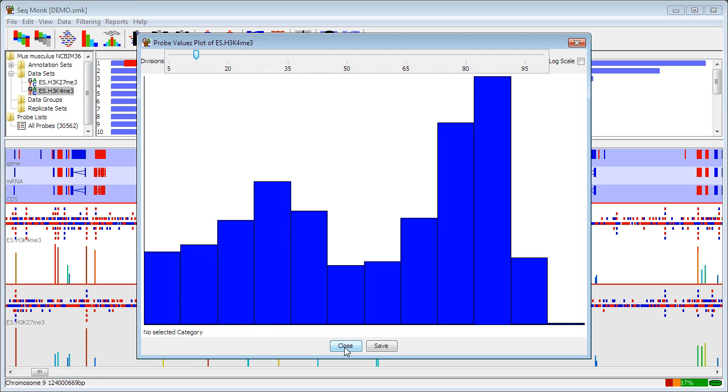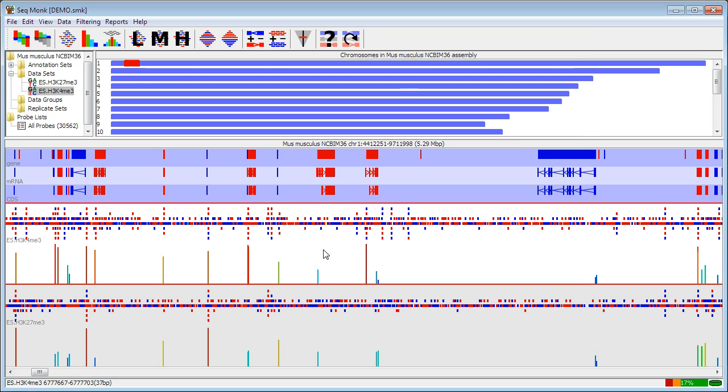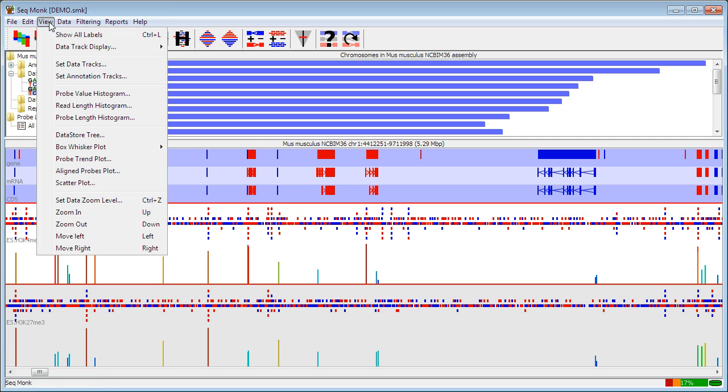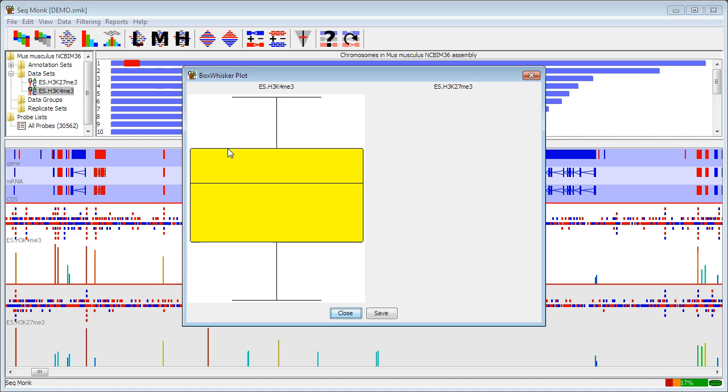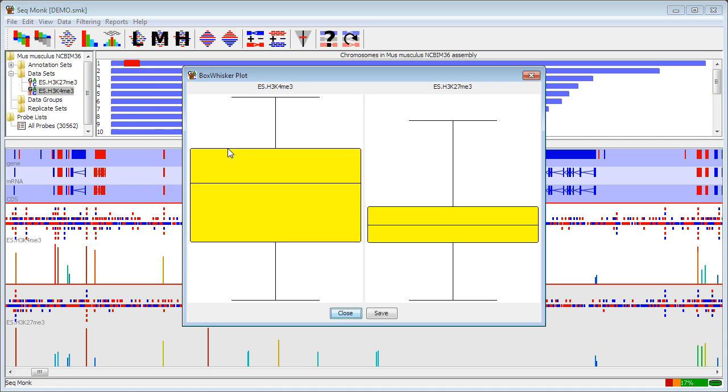If I want to compare multiple data sets there are a few ways to do this. If I have a lot of data sets I can go to view, box whisker plot and visible data stores and that will plot out a box whisker view for all of my currently visible data stores. In this case I have two data stores open and I can see that in general my distribution for my K4 modification is wider and the mean is higher. For my K27 it's a tighter distribution with a lower mean. So I can see instantly that there are differences between those two sets. These box whisker plots are on the same scale so you can directly compare between the two.